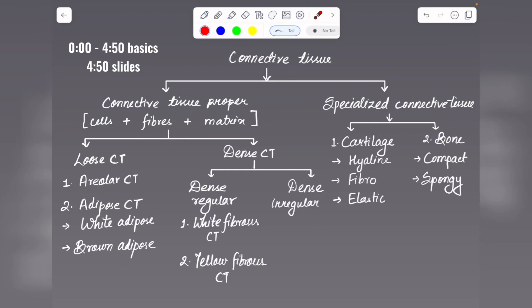In the previous video we looked at the histology of various epithelial tissue and learned how to identify them using tricks and tips. In this video we are going to look at the various slides of connective tissue and learn how to identify them under a microscope. At the beginning of the video you'll get a basic introduction which you can skip, and then slides will be prepared in the form of a photo.